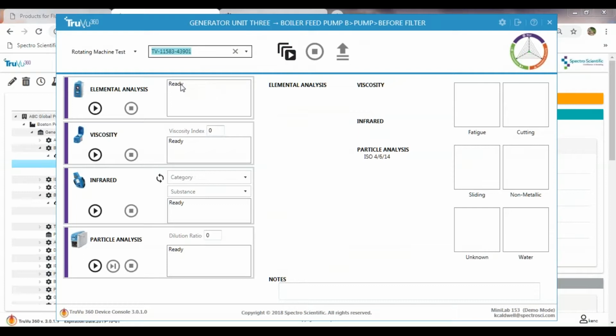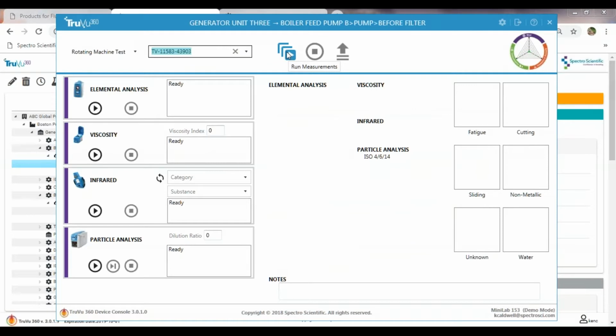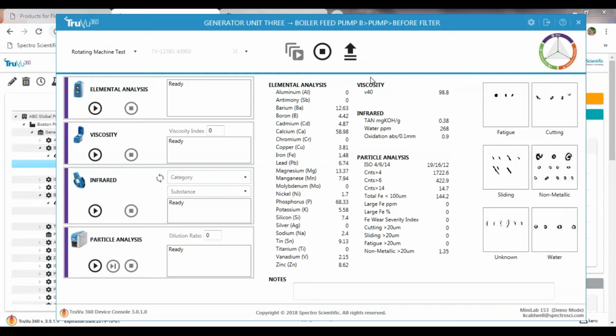When you go to run the measurements, you get both the individual text boxes, which can give you prompts or indicate necessary actions, and that's all the time. Or conversely, you could use, as I mentioned, the demo mode, which will show you. So again, I'm just running a couple of samples to populate data back up. I uploaded it. You can see again some color coding there. And I'll just run 4 more so we have trend data for a trend graph.